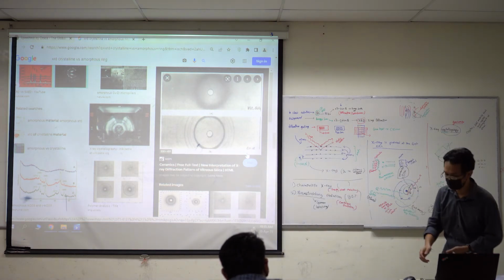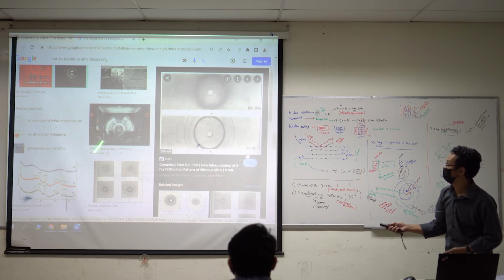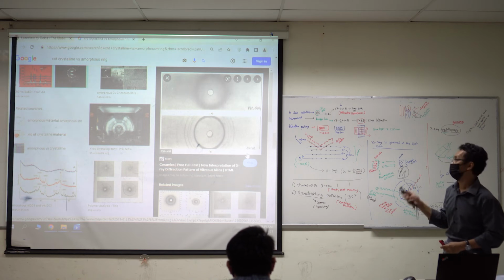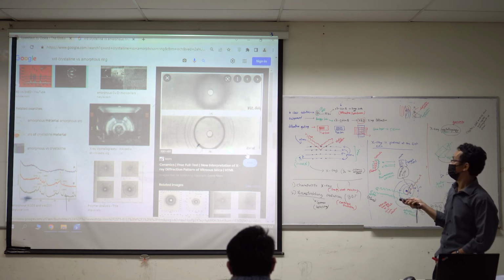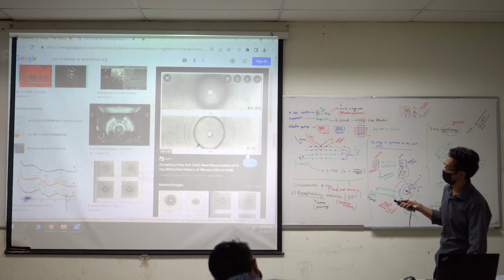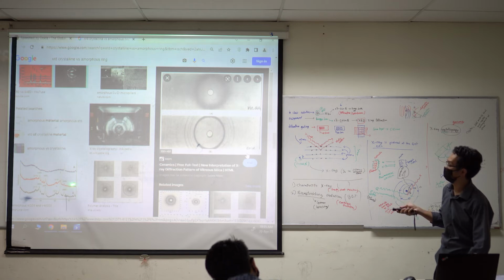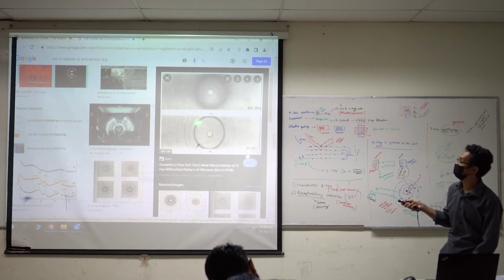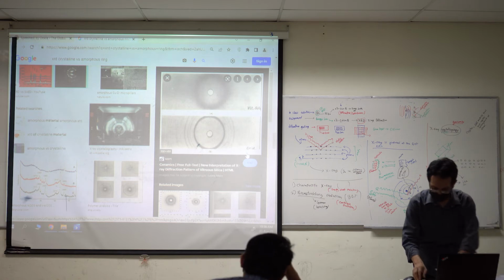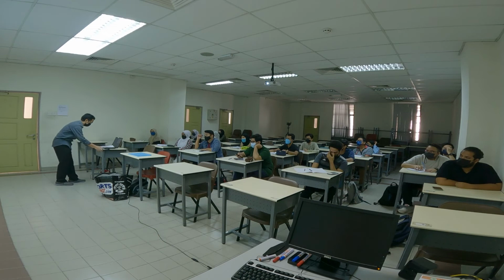Normally, with the modern XRD, you will get this graph. You use this machine, the one that has the 2 arms, and then you get this graph straight away. But these also have their own uses. Normally modern XRD just gives you this. Some XRD give you this, but it's for specific purposes only. Sometimes you want this, sometimes you don't. So that's about the XRD. Now we've covered XRD.